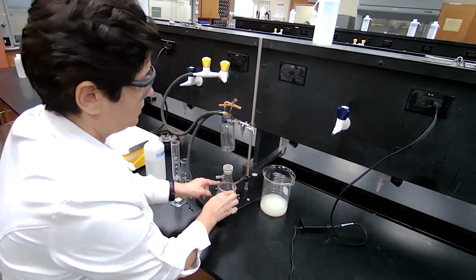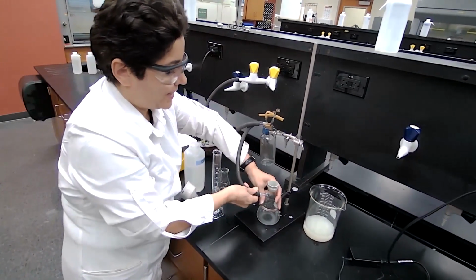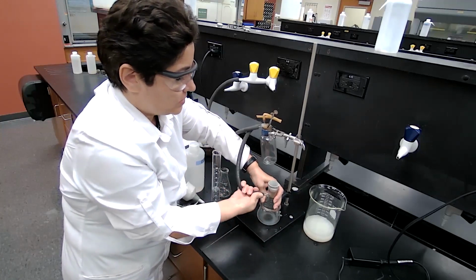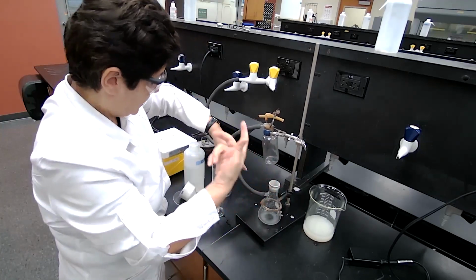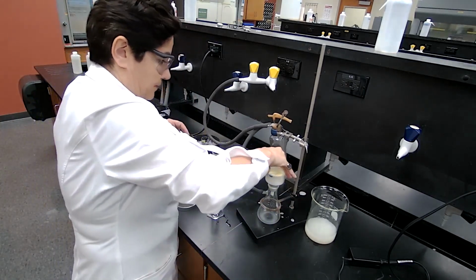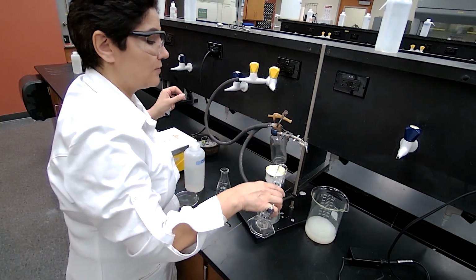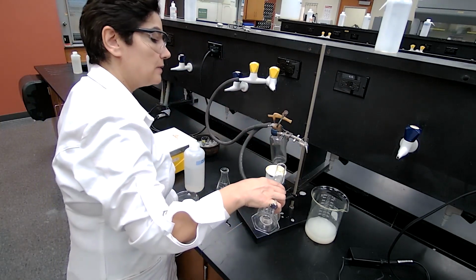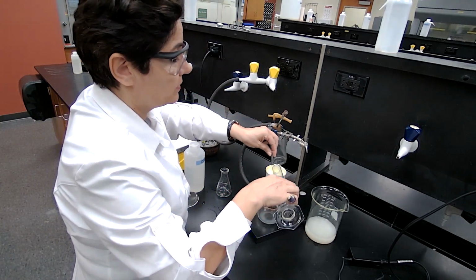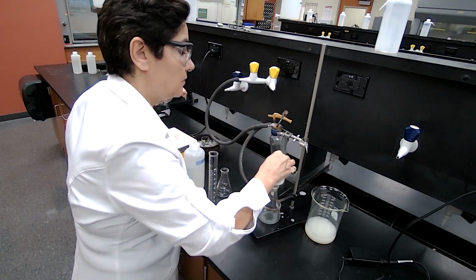The purpose of this clamp is to keep the vacuum flask in place, so when I turn on the vacuum, it's not pulled, dropped, and broken. Okay. Vacuum is off. I add the additional 50 milliliters. This is the third 50 milliliters of water. Mix it with the stirring rod, with the glass rod.